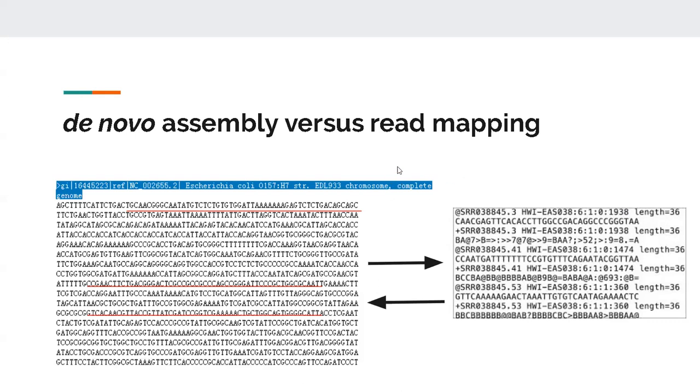But that's the first thing. Now, usually people have been sequencing and getting the assemblies of different DNAs of different species every now and then. So, for example, you have Escherichia coli assembled genome present on the database.